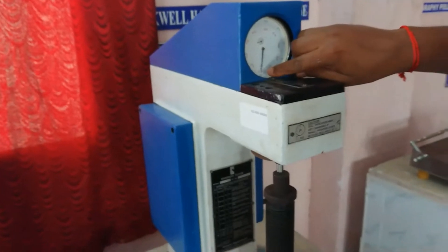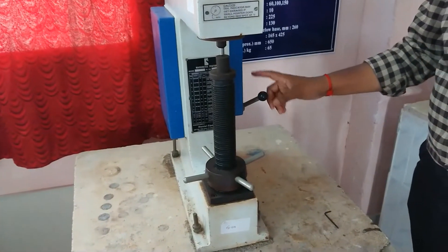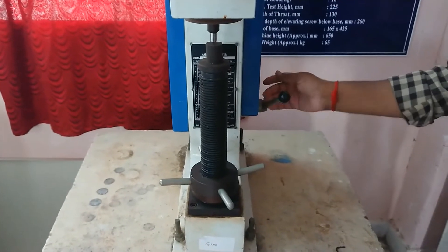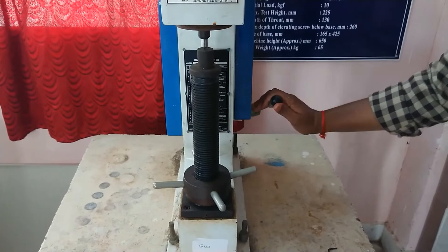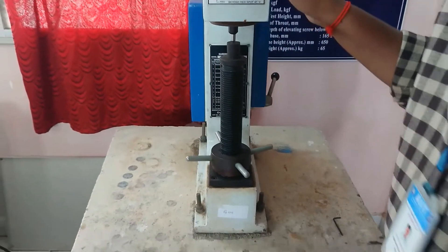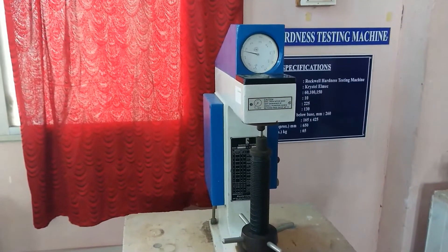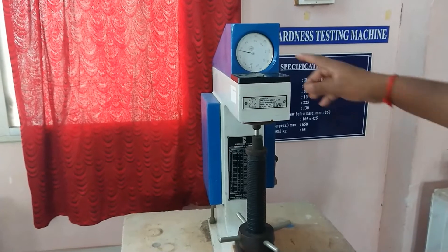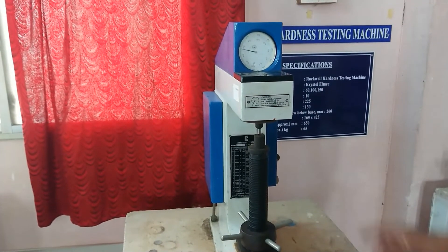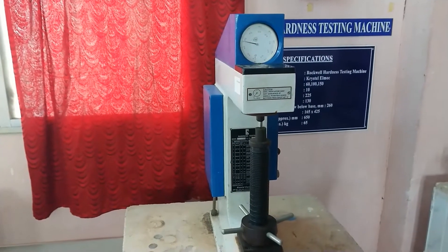Now it is at zero. Now we have to apply the main load. This is the load handle — turning it clockwise applies the load, and the other direction releases the load. Applying the load now. It will gradually move and then stop. You have to wait a few seconds for it to stop completely. Once it stops, you have to release the load.